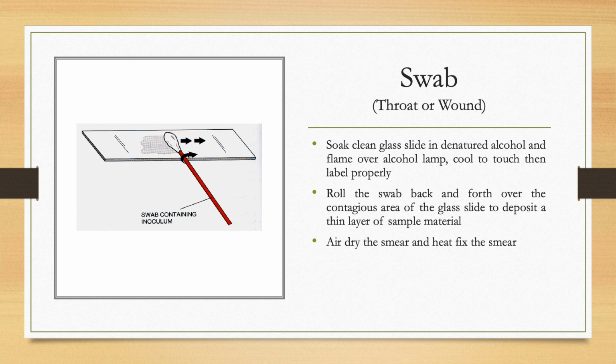Alright. Note that smears should not be prepared from a swab after it has been placed or used to inoculate culture media. And the swab should never be rubbed back and forth across the slide. Rather, you should roll your swab on the surface of your glass slide.